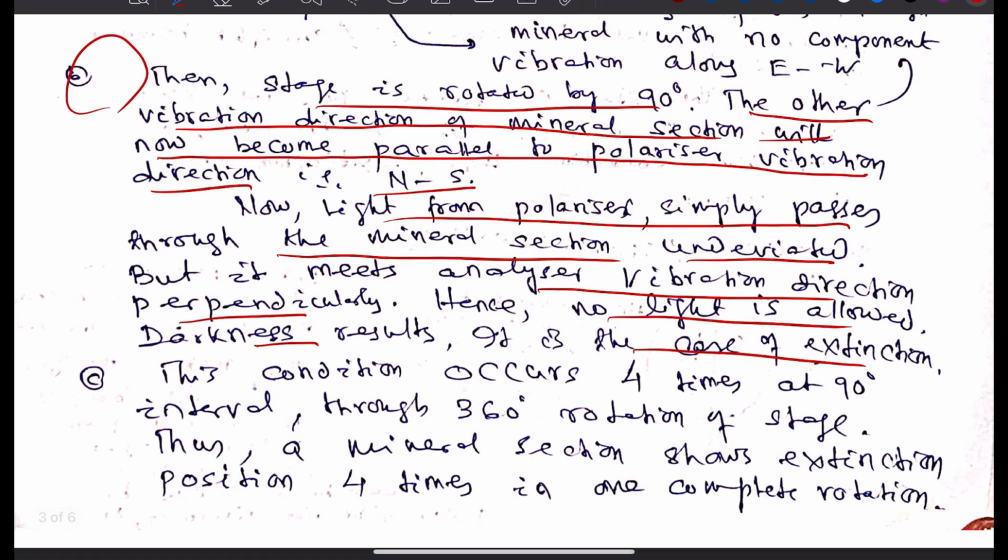And as the mineral section's vibration directions are mutually perpendicular, and the polar directions are mutually perpendicular, when the stage is rotated, they will match 4 times.